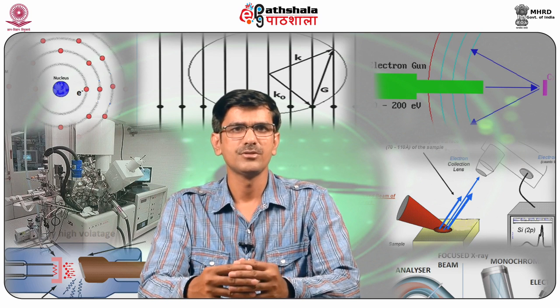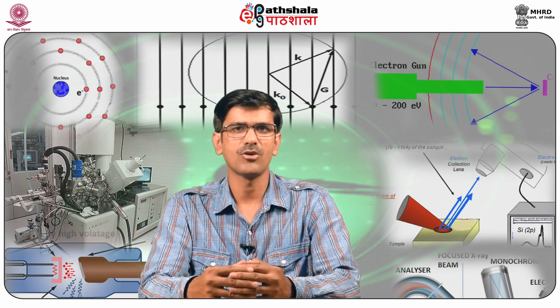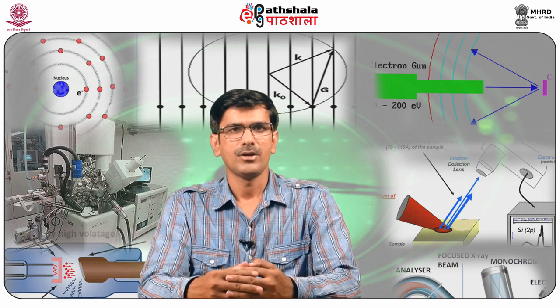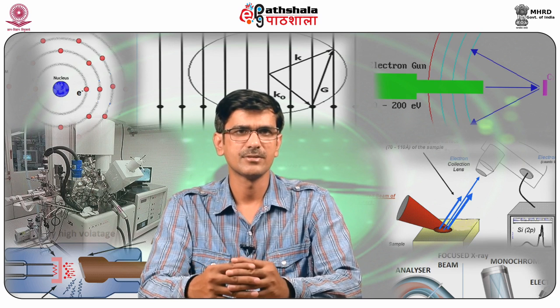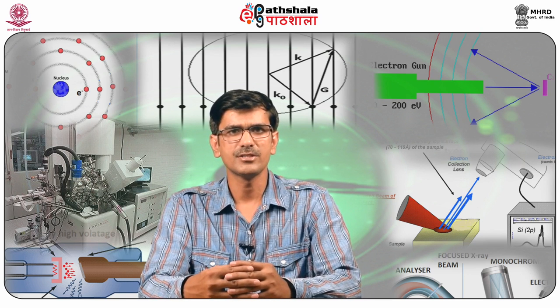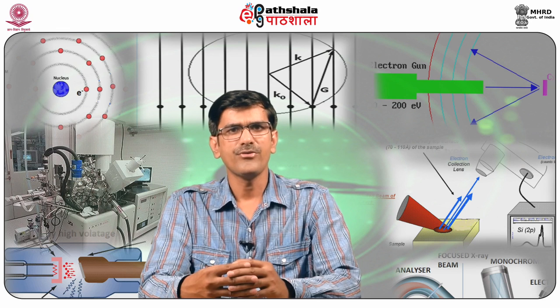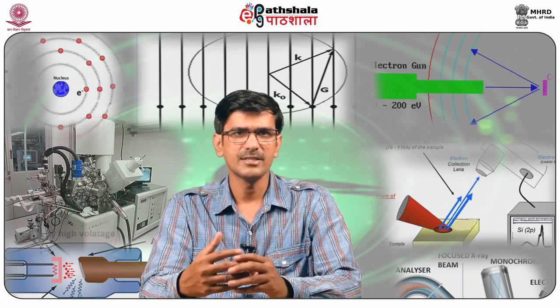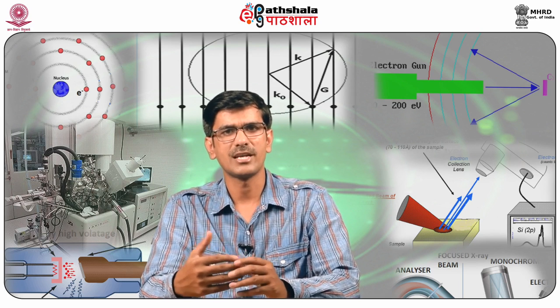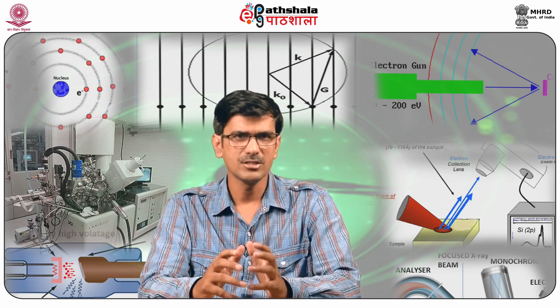Now the type of information given by X-ray diffraction analysis. The kind of materials that compose a solid. This information is called qualitative analysis. The second is the quantity of material that composes the solid. It is called the quantitative analysis. The third is the quality of materials that are crystallized, so it is called the crystallinity. The amount of stress present in the solid is known as residual stress. The size of the crystallites that compose the solid is called the crystallite size. Average orientation of the crystallites that compose the solid is known as texture.